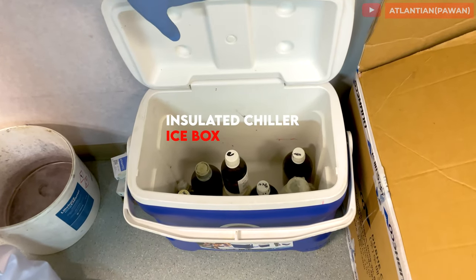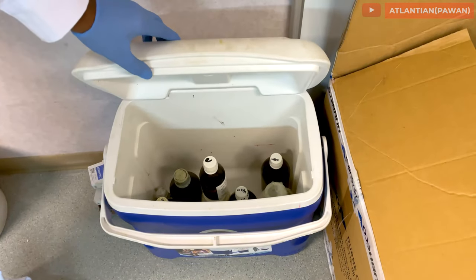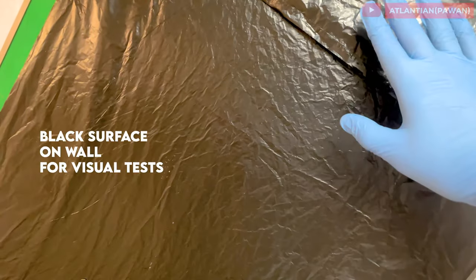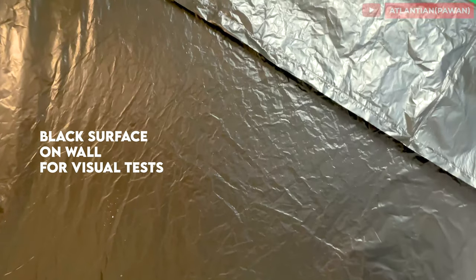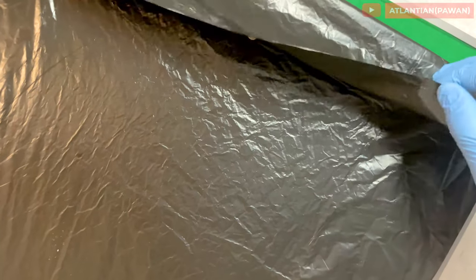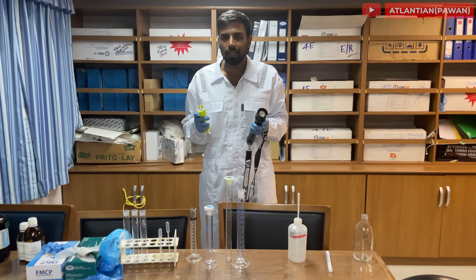You also need a cold bath, which is required for the PTT test. You must also have a black surface — either a black garbage bag or something similar — just to do your test behind, because the sample must be checked against a black screen.